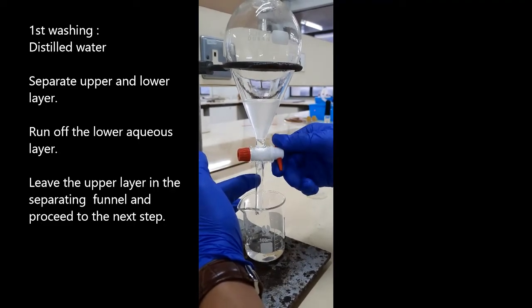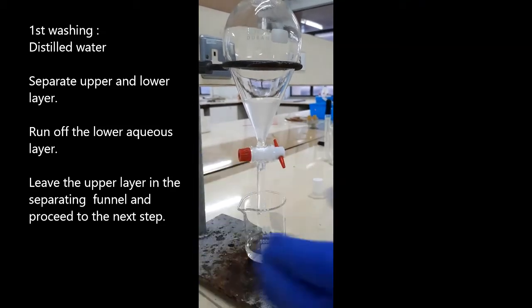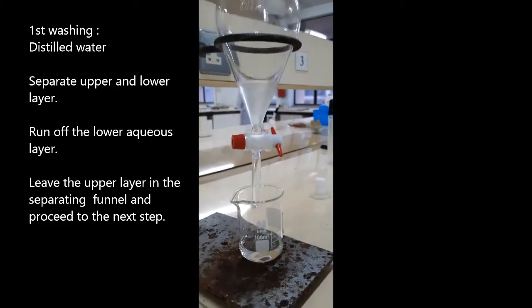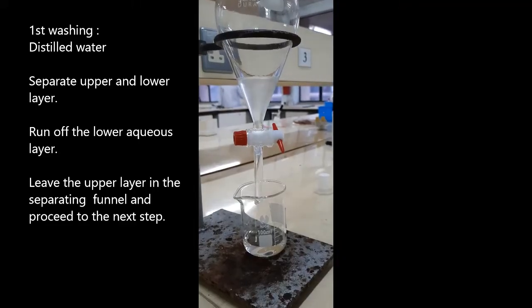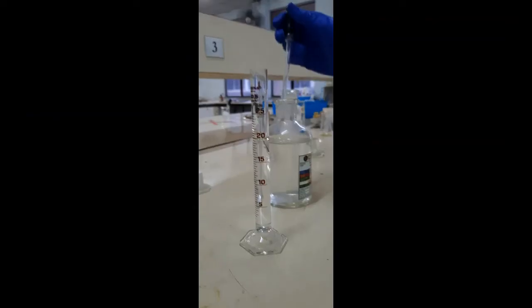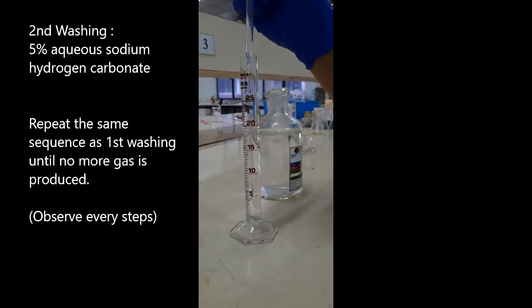Leave the upper layer in the separating funnel and proceed to the next step. Add 5% aqueous sodium bicarbonate solution. Observe the formation of two liquid layers. Repeat the same steps seen in the first washing.